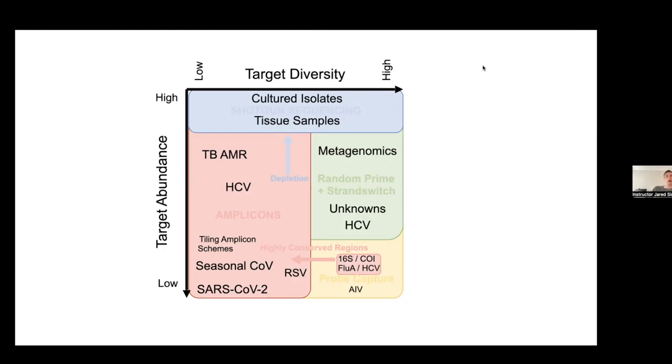Yeah, so I'll answer the culture question first. Essentially, any method that you use that you can culture your bacteria in would be sufficient for sequencing. The culture takes a clone and expands it up to many copies, where there's going to be enough DNA after you've cultured it that you can do an extraction and then sequence. So I don't think there's a particular culturing method I can recommend that's appropriate for whole genome sequencing work. As long as you can culture it, you should be able to extract DNA and then off you go.